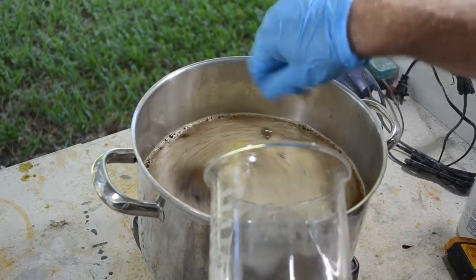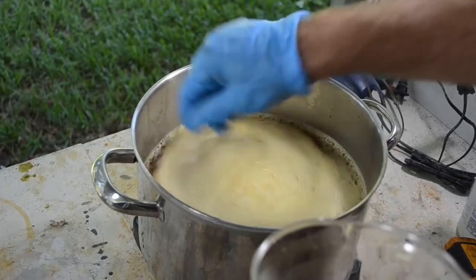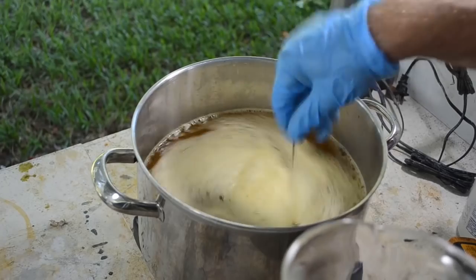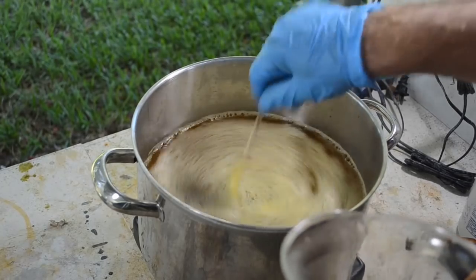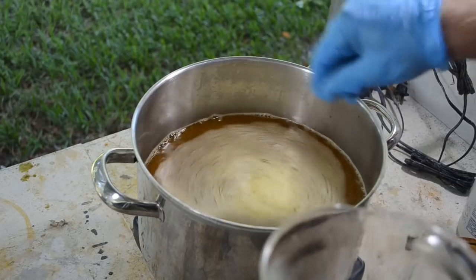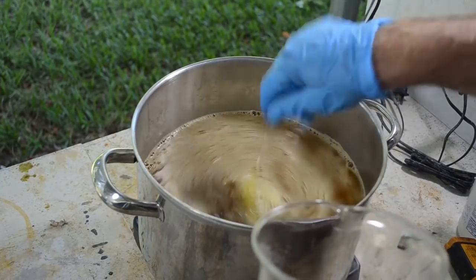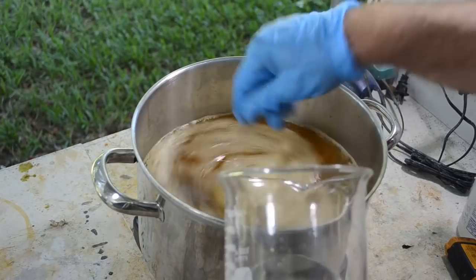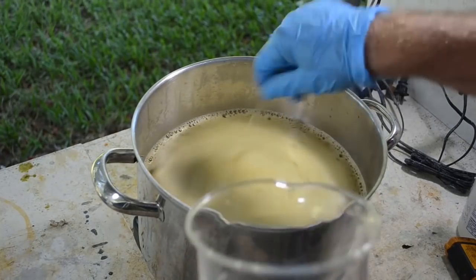Put a little more in. There we go. And stir it really good, or you can have sort of areas of high pH and areas of low pH. And when you go to measure it, don't measure the foam. Measure the liquid, because the foam can be either high or low compared to the liquid. You want to measure the bulk of the liquid. Make sure it's all stirred up good, and you measure the bulk of the liquid. All right.